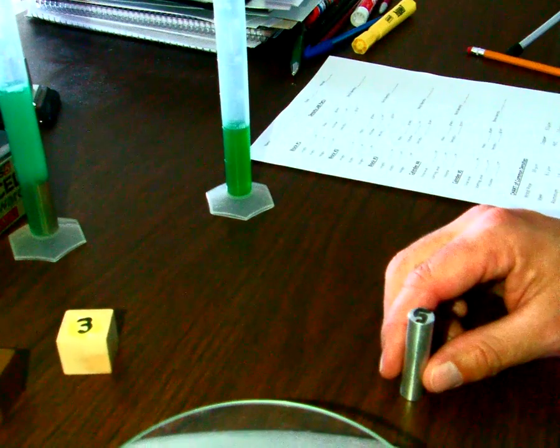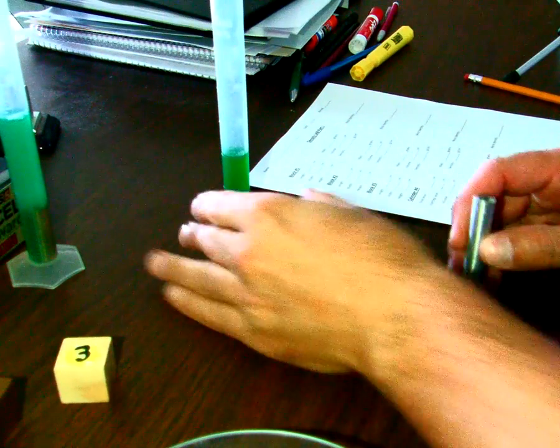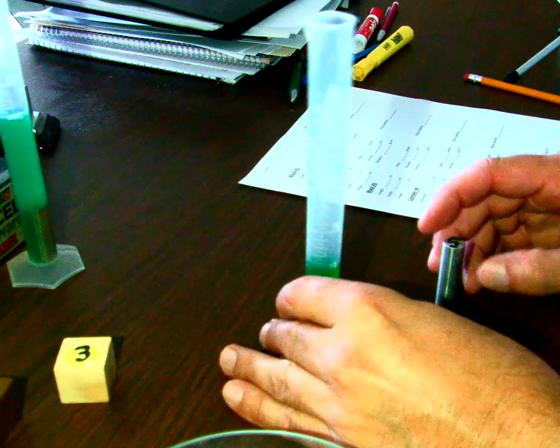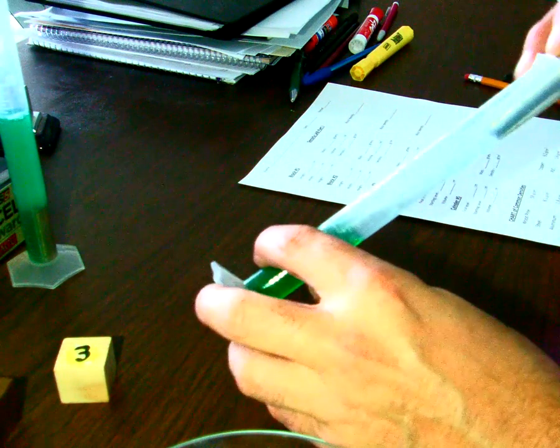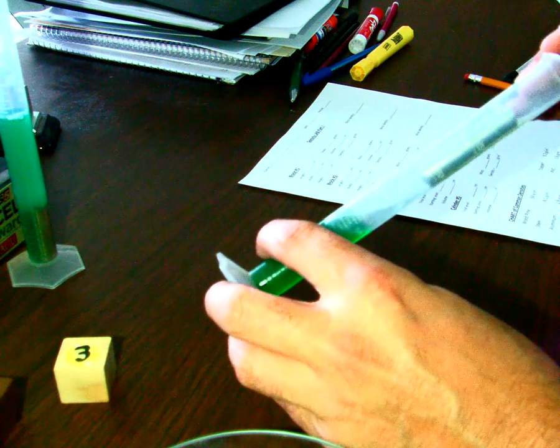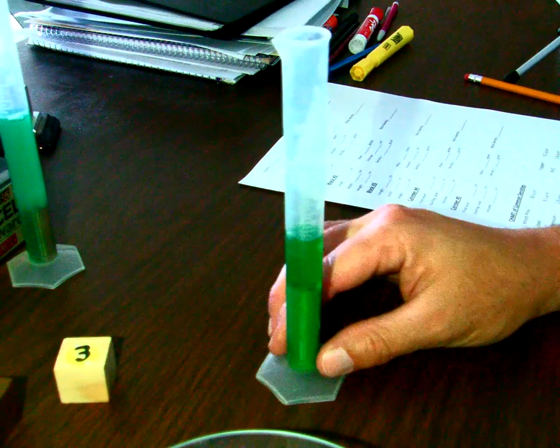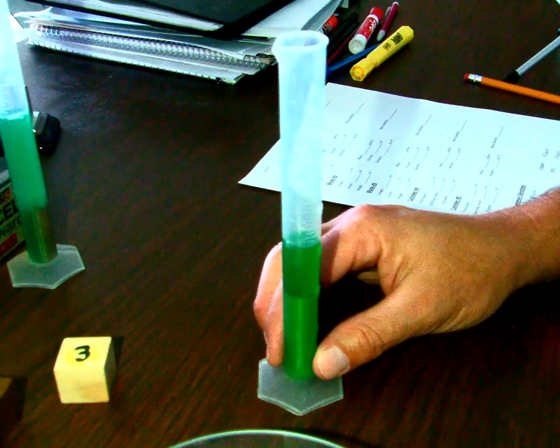That's our mass. And then what we're going to do is put this cylinder into our graduated cylinder that had 10 milliliters to start off with. And I'm going to do the same thing. I'm going to tilt it over so it slides a little bit better in there. We don't make a big mess. All right, excellent. So let's take a look at our new height.